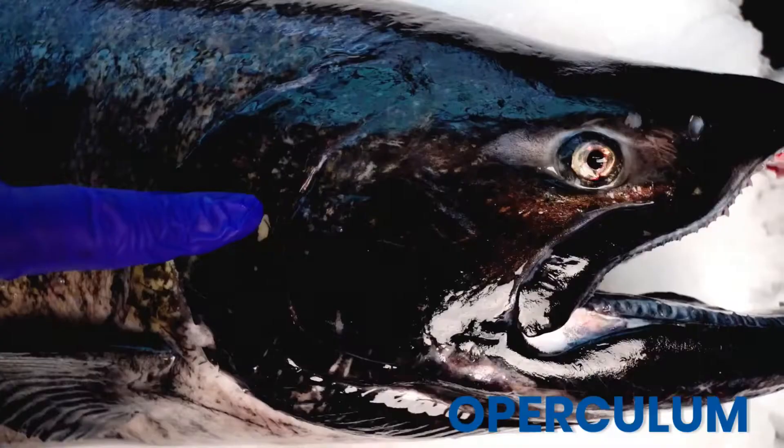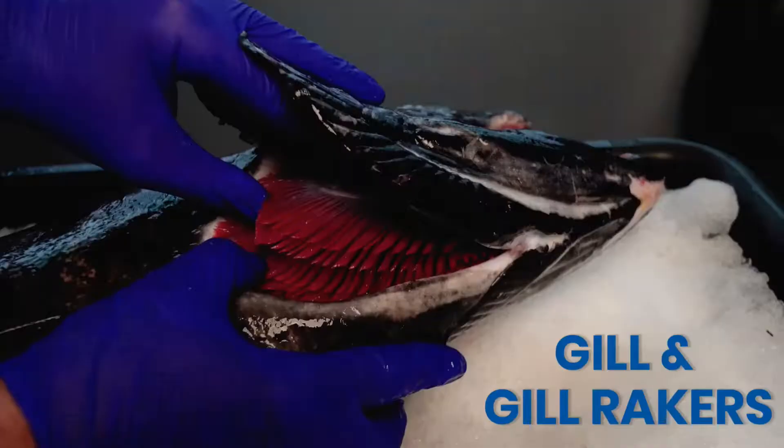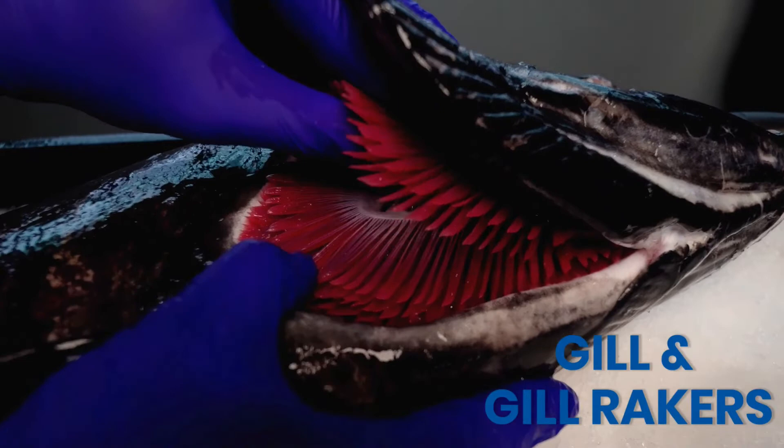In the steelhead trout dissection video, I asked what are the two main functions of the gills? The answer is gas exchange and ion excretion.